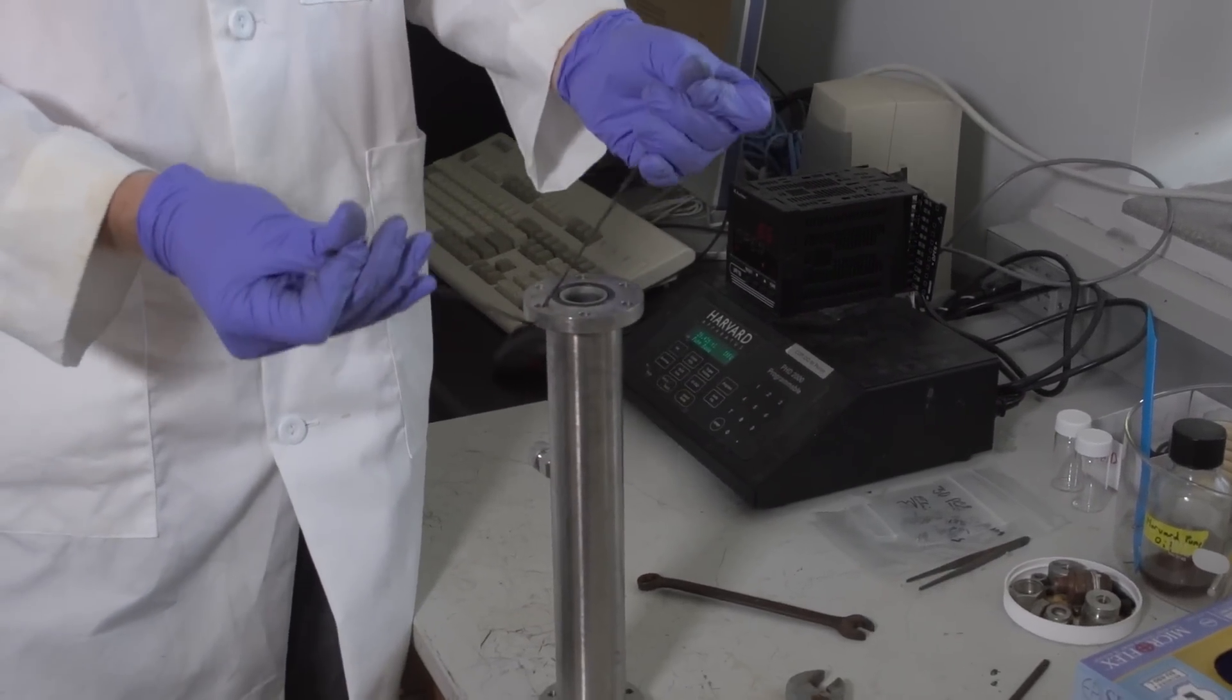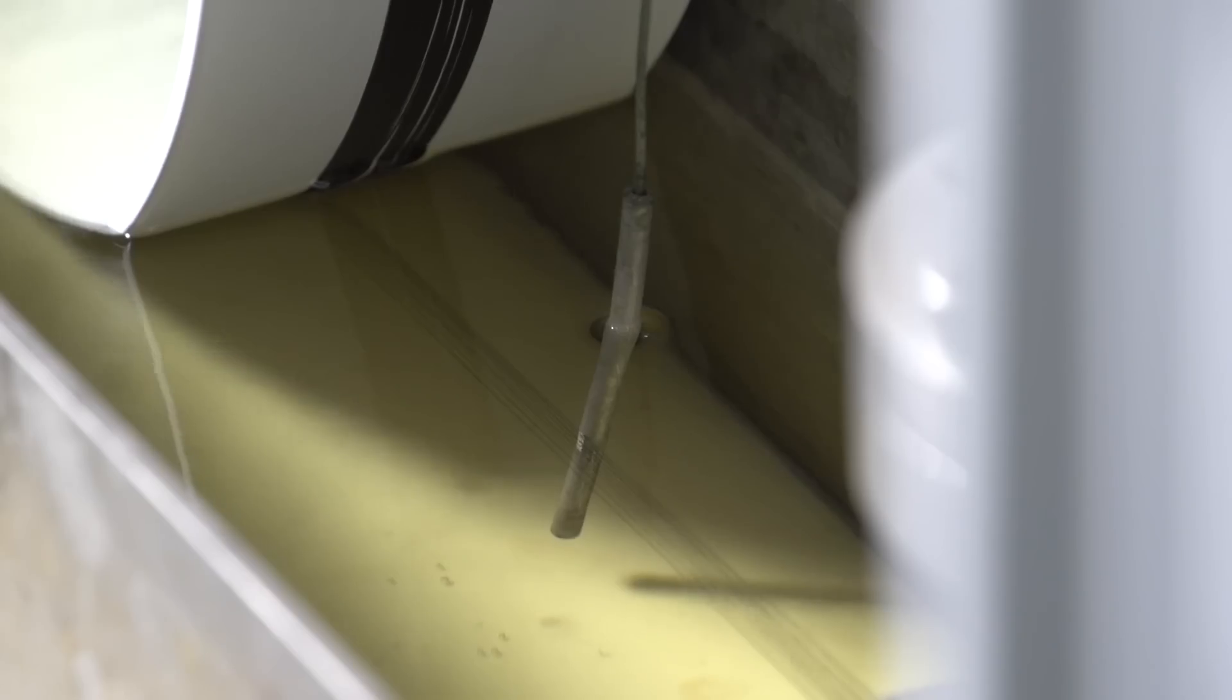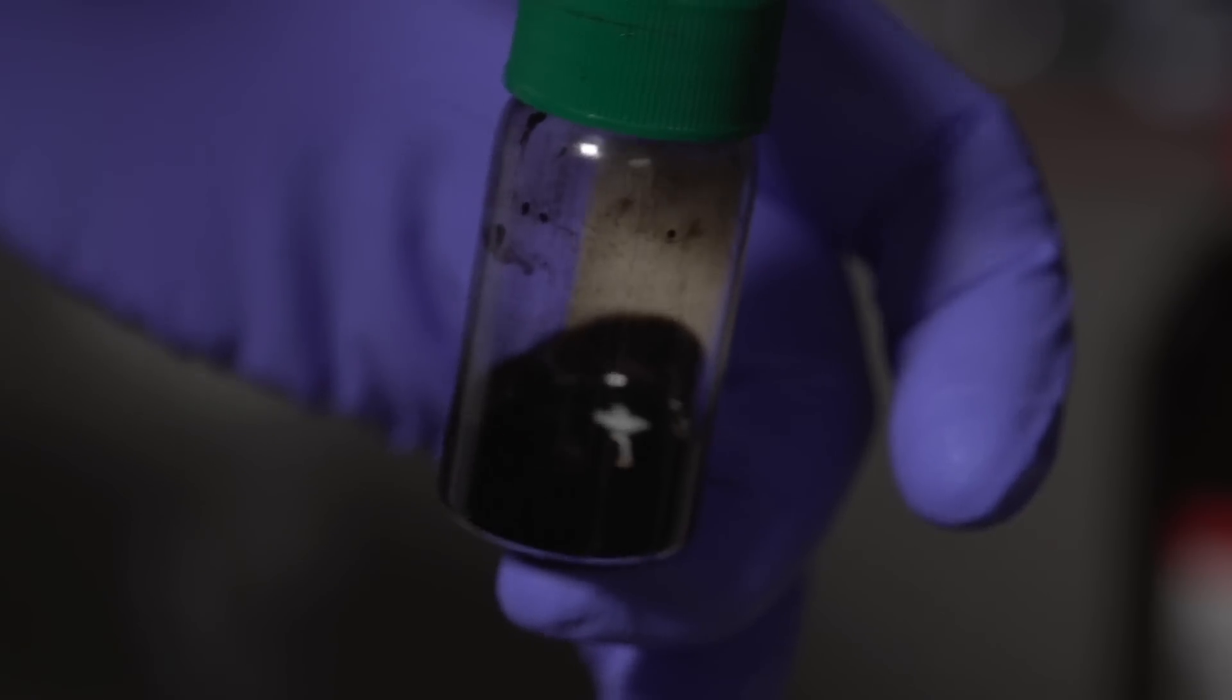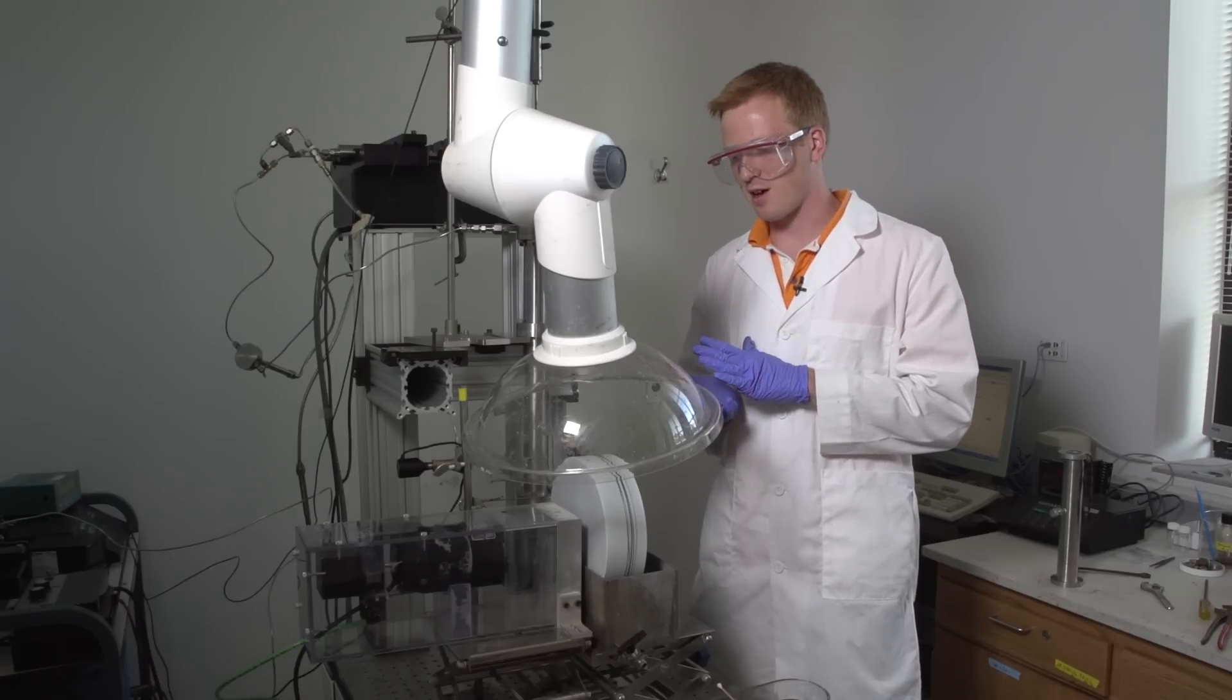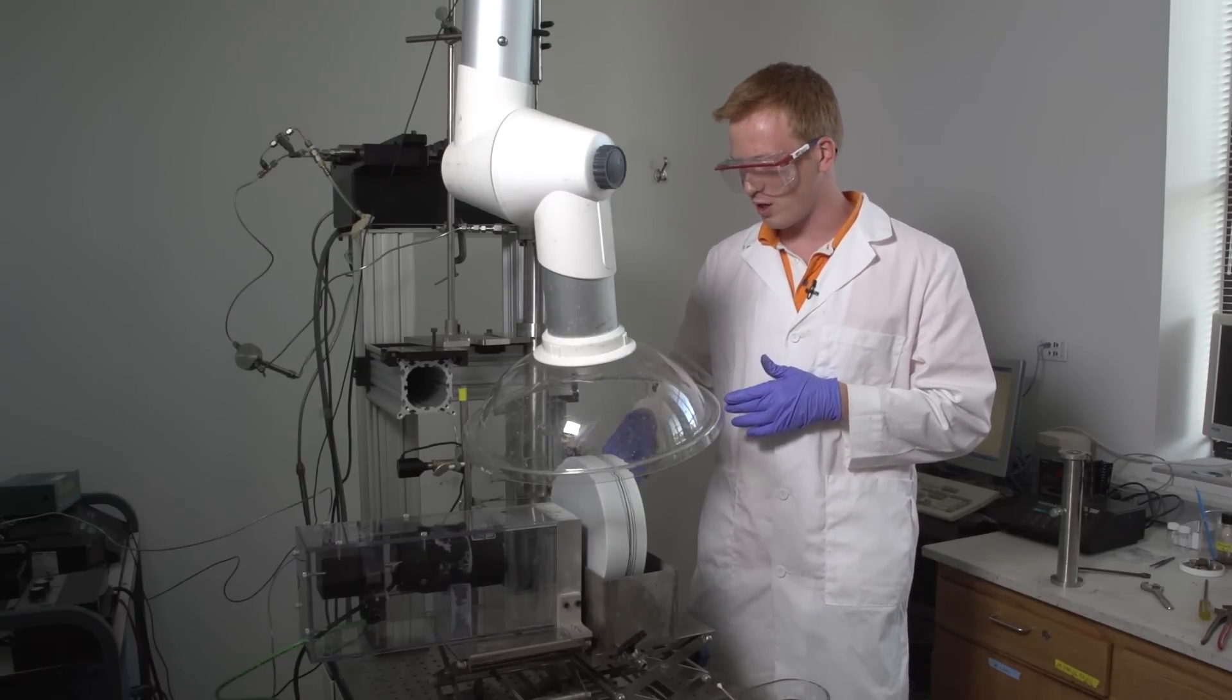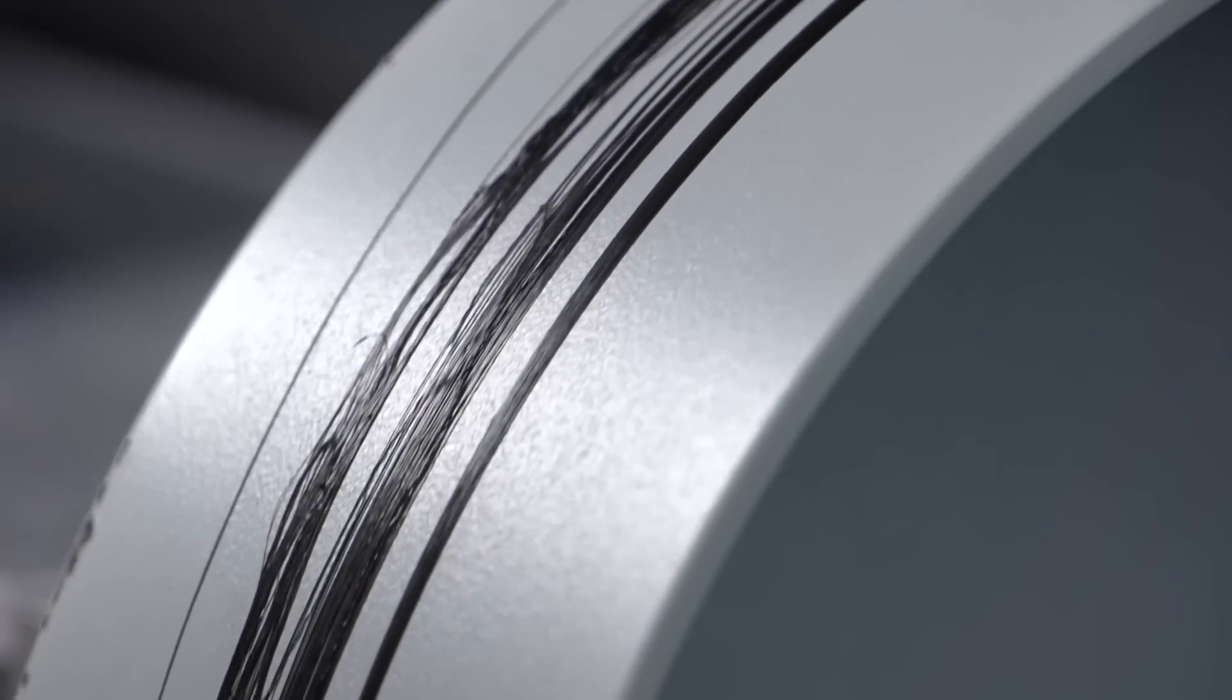This is the spinning cylinder. We have carbon nanotubes that are dissolved in a solvent, which is chlorosulfonic acid. This solution is a very viscous type of material, kind of like mayonnaise in viscosity. And we're extruding it through 19 small holes and then winding it onto a drum.